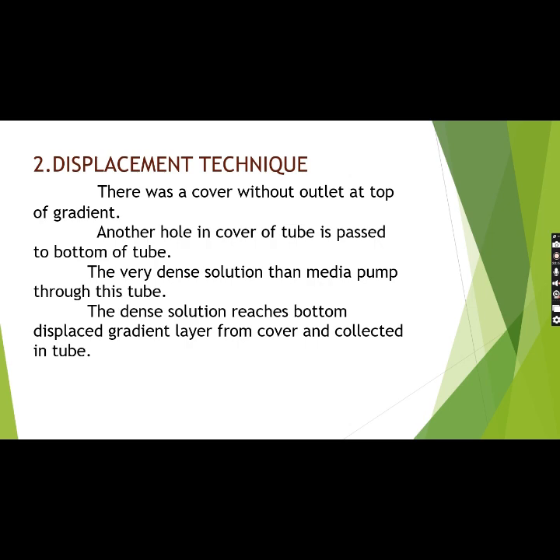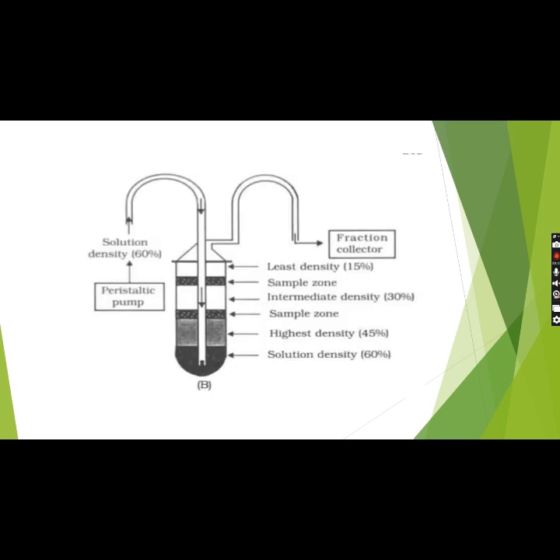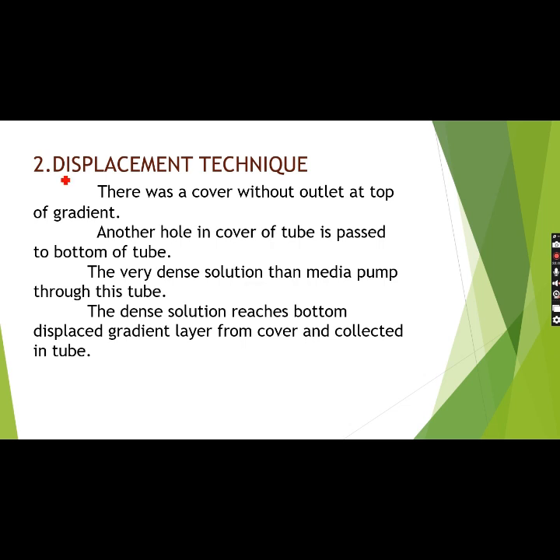Displacement technique. In the case of displacement technique, from the name itself, we can identify that each cell component with its gradient is going to be displaced off by this technique. Compared to the puncturing technique, which does not disturb any other component, where the component is separated by puncturing at the test tube bottom and separated manually with a tedious process.